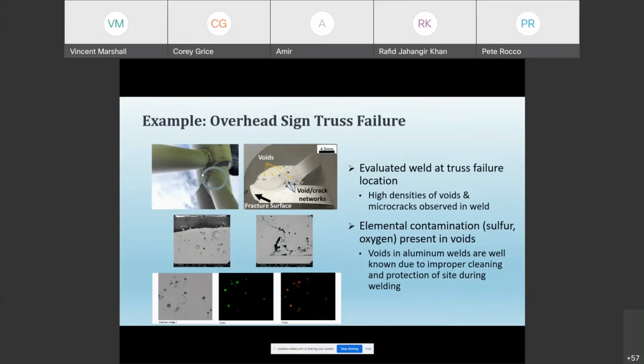So aside from doing some more traditional fracture analysis and trying to see where the crack initiated and how it advanced with fatigue, we finally were able to identify where it occurred, and it was basically the welds. We did analysis of the individual welds, to see not only whether there were some voids there, but also the cracking that formed in between the voids, and to understand how that came to be. So a lot of reverse engineering. That's something that you wouldn't necessarily consider a laboratory measurement per se, but these are all capabilities that you could use here as part of your research as needed.